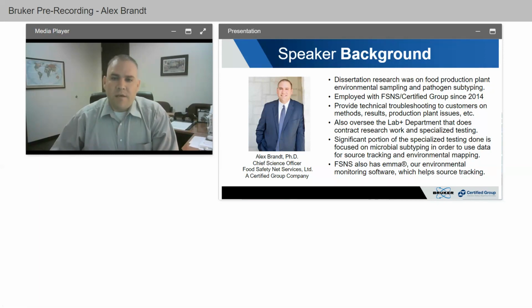So when I joined FSNS and Certified Group in 2014, I was brought on to provide a lot of technical troubleshooting to customers with regard to their methods, their results, and also their production plant issues where they had contamination problems. I still do a lot of that work now, going out to customers to help them with issues. So I can see the value of microbial subtyping in a lot of that work. That's what I want to focus on with you all today, and show you how some instrumentation, provided by Bruker, can possibly help you with that.